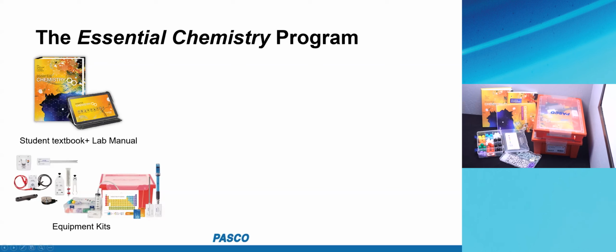That's in the standard, and then there's the extension kit. And by the way, if you had an older kit from the Essential Chemistry program from a few years ago, it looks slightly different. It won't have the drop counter. Now we include the drop counter. This is the drop counter right here, along with a holder for it for a ring stand. This is like a burette where it dispenses drops, so this will automatically track the volume for you, like in a titration. So that is now in the expansion kit. This is part of the expansion kit, as well as the voltage sensor and the conductivity sensor, plus the colorimeter and turbidity sensor. So we're not going to get to the colorimeter or voltage sensor or drop counter today.